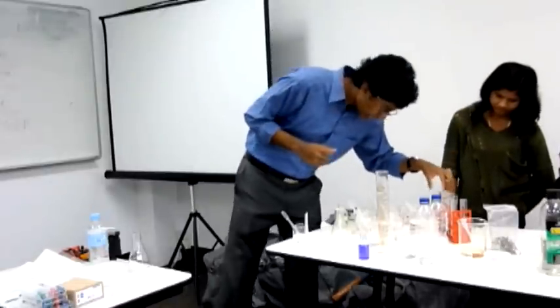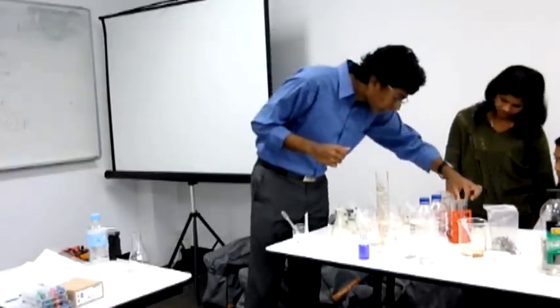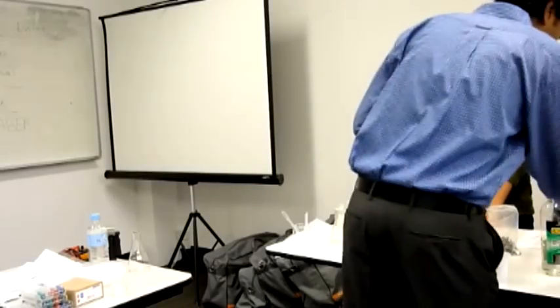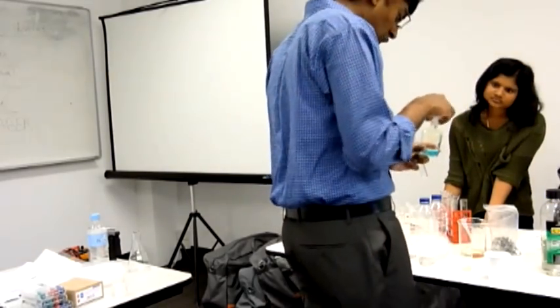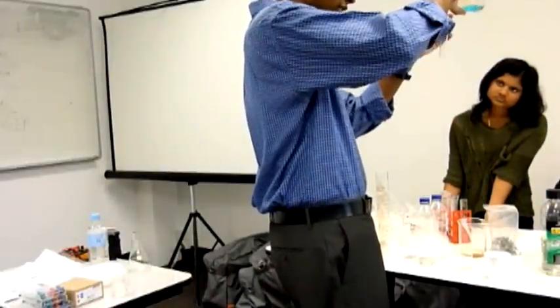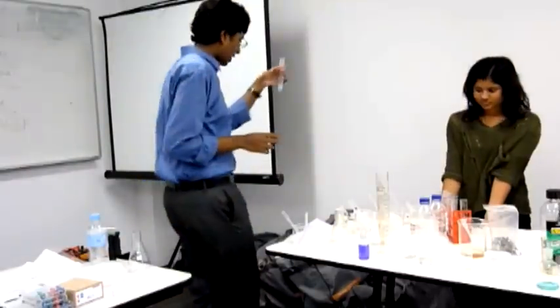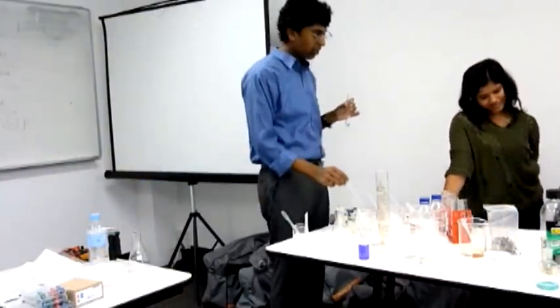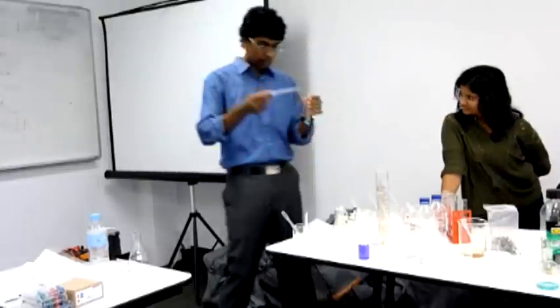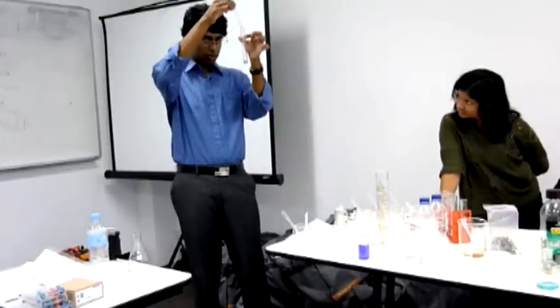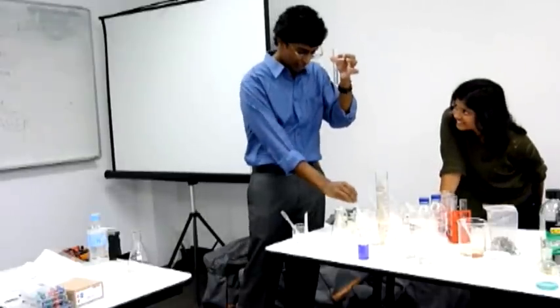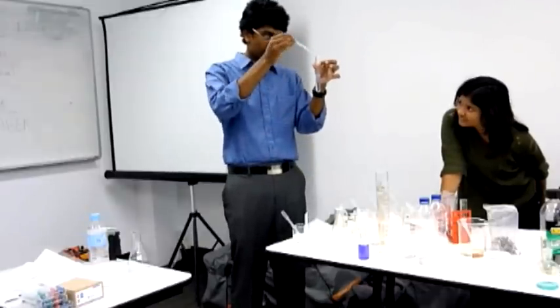Pong wants you guys to see copper nitrate. Alright, no worries, we'll do it. So just so that you guys know, if there was copper in it, how we would definitely know is because we would see a very clear blue color, which I will now show you. It's blue already. What are we supposed to add to test for copper? Ammonia. Not yet, what do we have first? Sodium hydroxide. Sodium hydroxide.